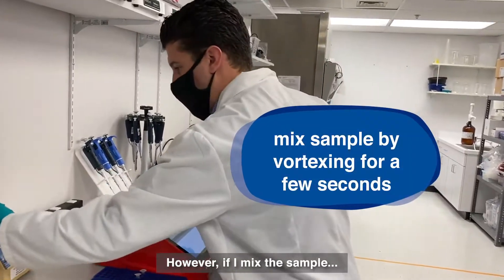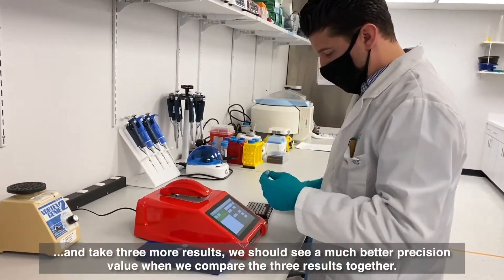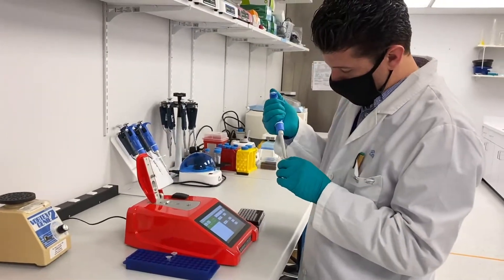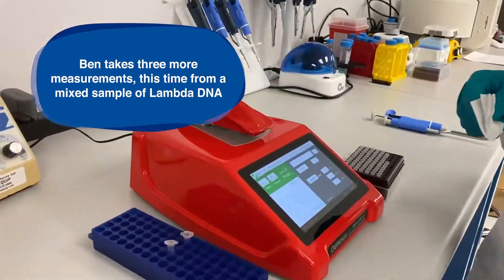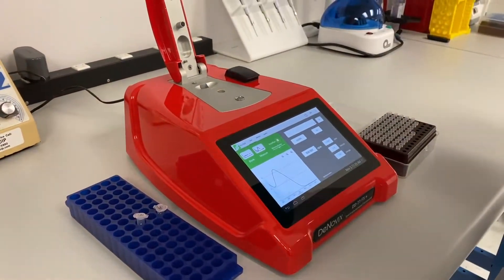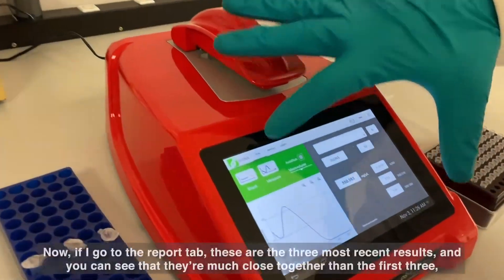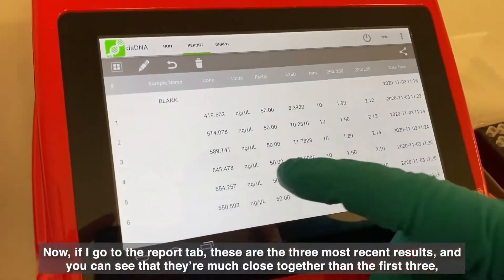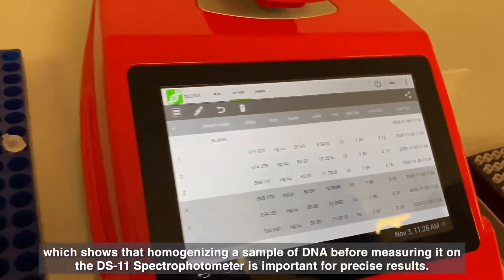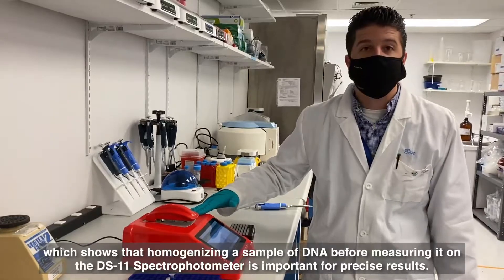However, if I mix the sample and take three more results, we should see a much better precision value when we compare the three results together. Now, if I go to the report tab, these are the three most recent results, and you can see that they are much closer together than the first three, which shows that homogenizing a sample of DNA before measuring it on the DS11 spectrophotometer is important for precise results.